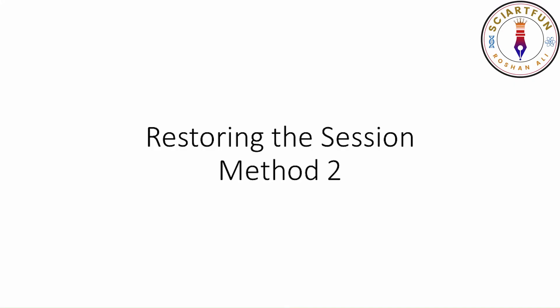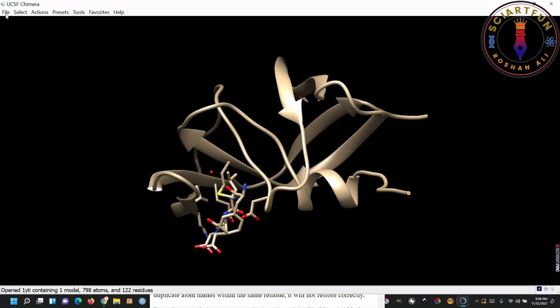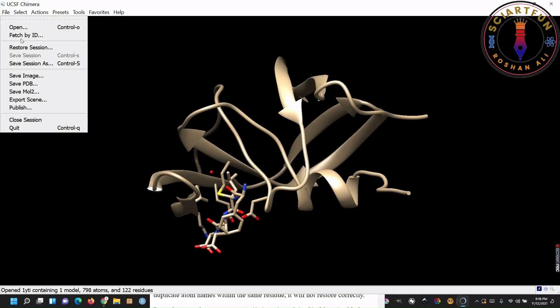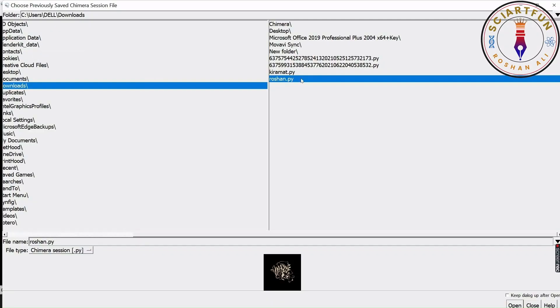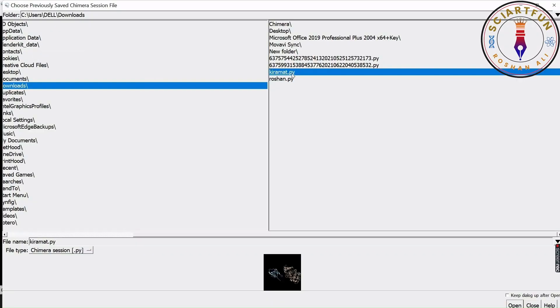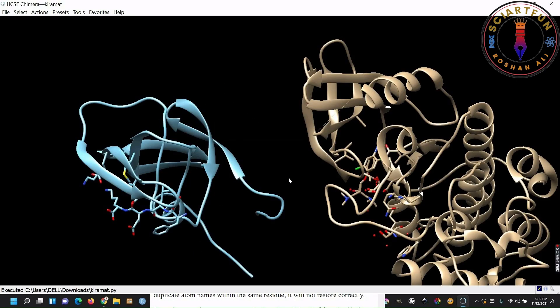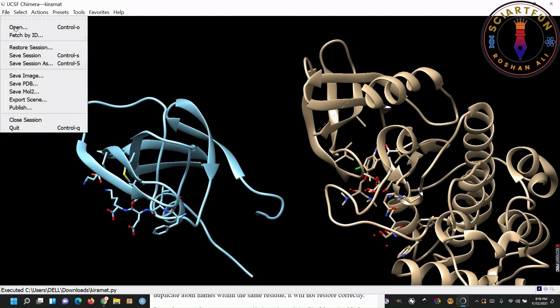Our next objective is to restore our saved session. To do this, just go to file menu, click on restore session. Go to the location your session is saved in, then click the session file, and open it. Close the other windows before opening the new session. Look, the session is opened now. As you can see, the two molecules are opened in the same angle, same position, and same state, in which they were saved.